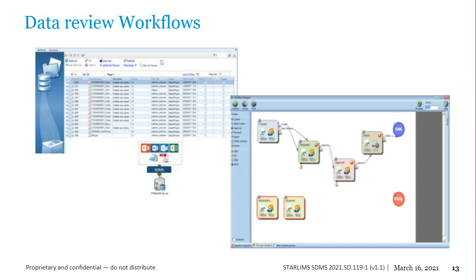So here you can see a screenshot of the Workflow Designer window, which allows you to create new workflows or edit existing workflows. The Designer is a graphical tool. It's basically drag and drop, and allows you to build and visualize the workflow using boxes, the squares that you can see, and logic operators.